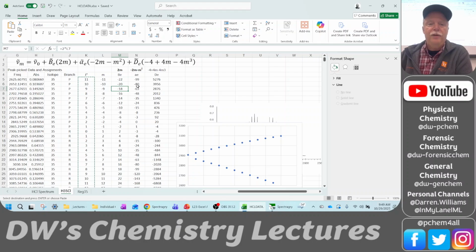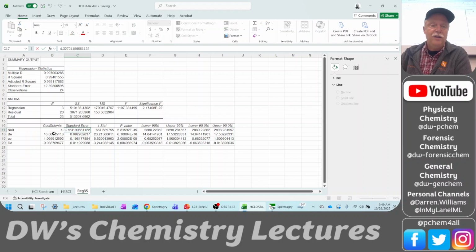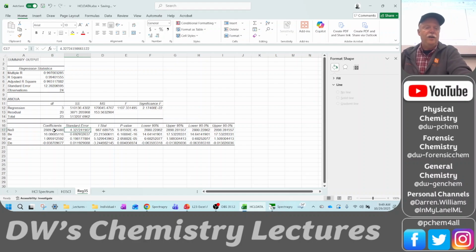I'm actually glad that happened because we could see what a bad regression looks like. This is a crummy R squared for this kind of analysis. We should have 4 9s at least, and sometimes 6 and 7 9s. Also, look at the standard error. This is 4 wave numbers of standard error. If we were to let the standard error tell us where to round, this is what our vibrational frequency would look like. This is what our rotational constant would look like, right? So our standard error and the coefficient should be rounded to the same place value, okay? Whether it be tenths, hundredths, or whatever.